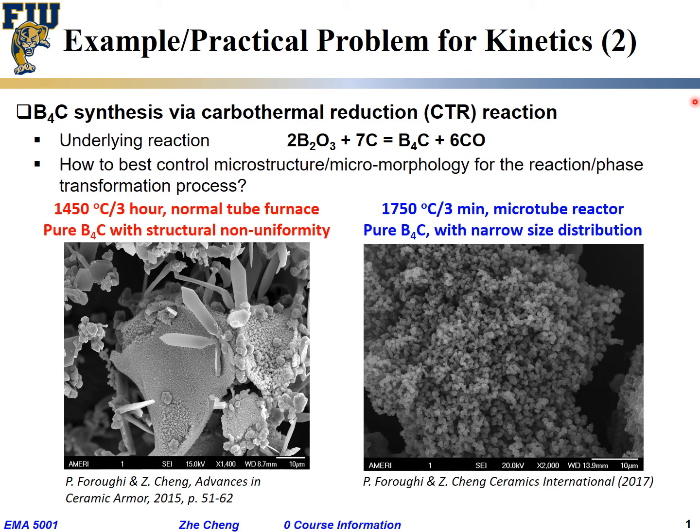Again, what is the scale bar? Still 10 micron. Okay, so roughly the same magnification. You see what I mean? But now you look at the microstructure. You would call this pretty much, compared to here, uniform, right? Pretty much uniform.